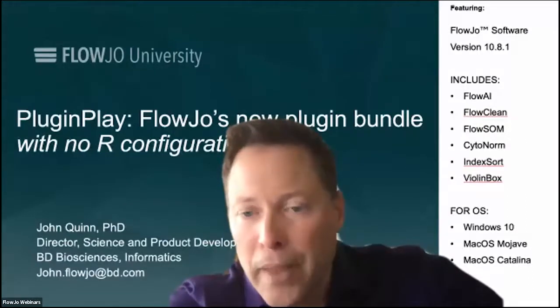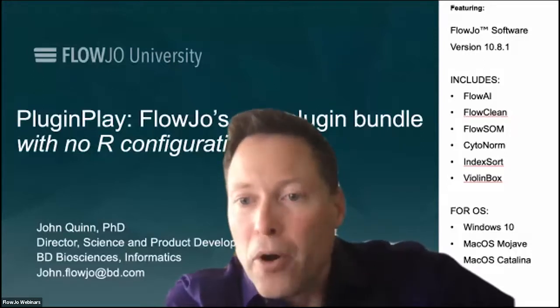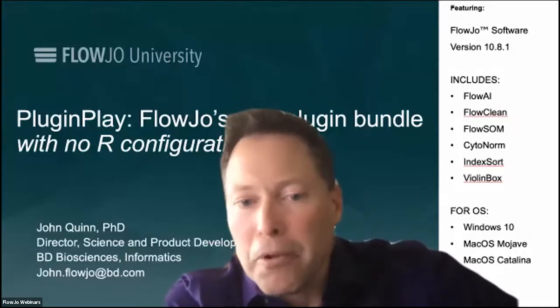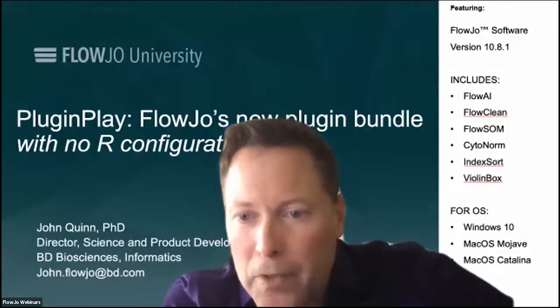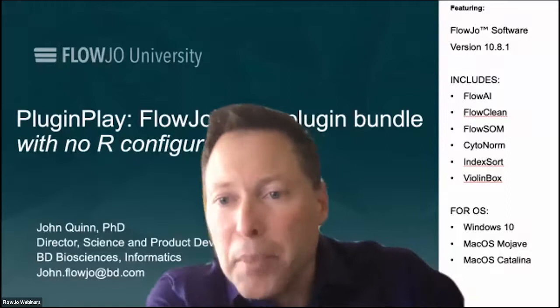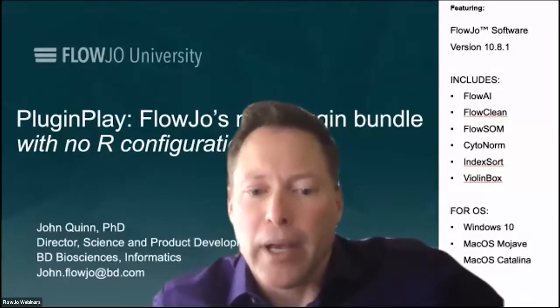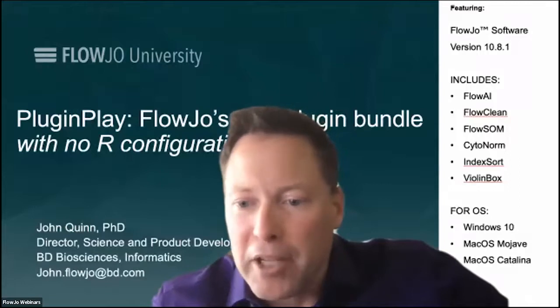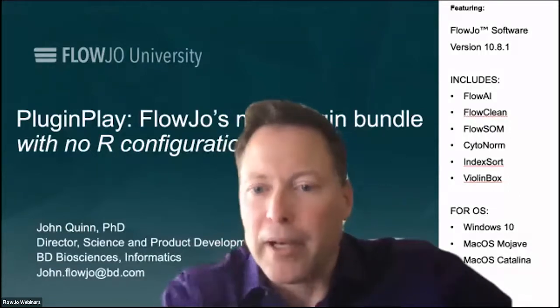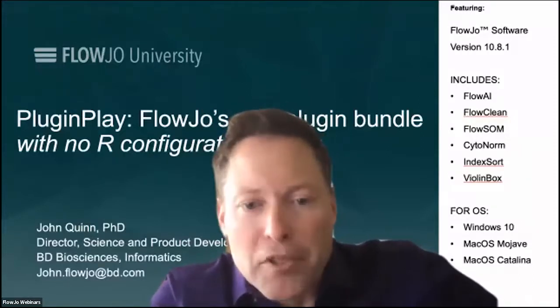going forward. Just to set the stage here, plugins are add-on algorithms that anybody can develop. Many of them are developed by people outside of BD, people who are doing research into bioinformatics software. So we have limited control over them, and what language they're written in and so forth. But I think they're really important to be able to support.